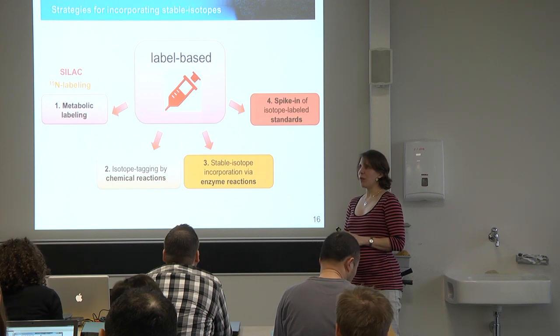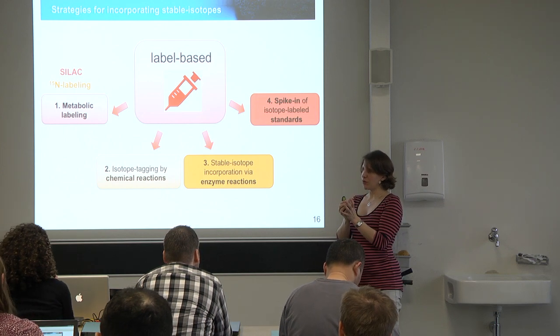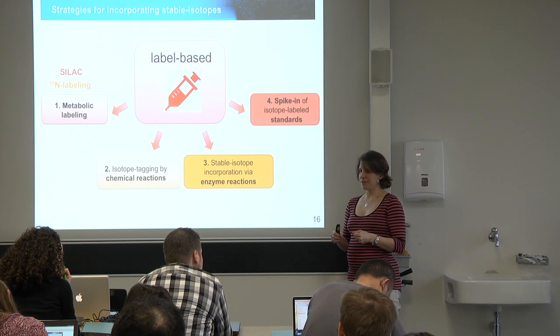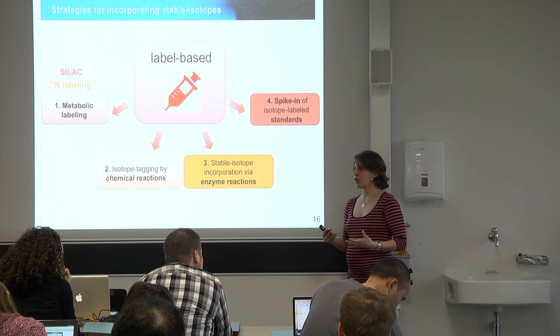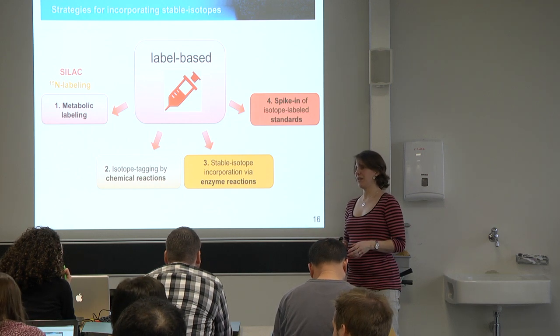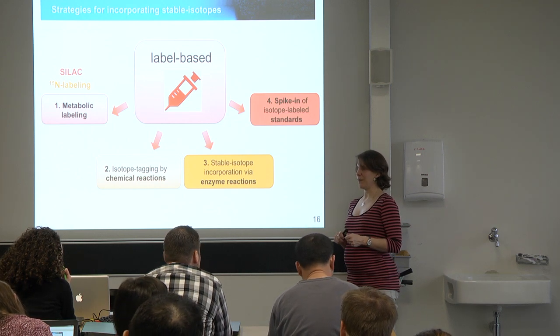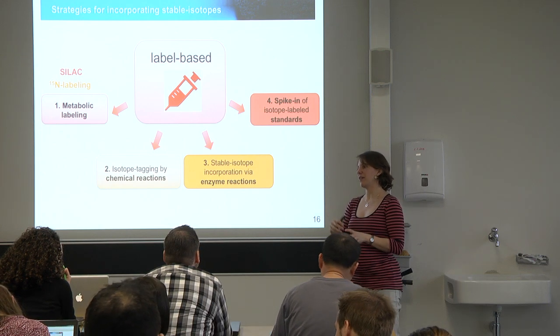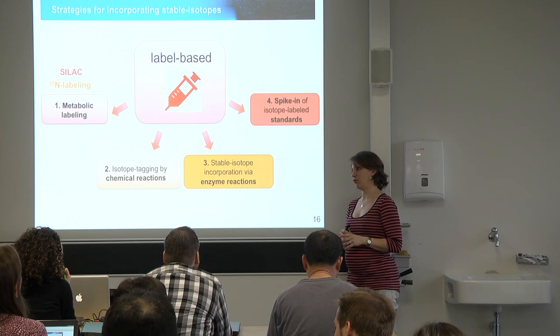If you want to normalize for total protein amount, one also very good way is to do a shotgun analysis, or to do an analysis where you measure as many proteins as possible and not just a few as with SRM. Because then you can assume that the TIC that you see over a lot of data points should be constant overall. This is what people do.